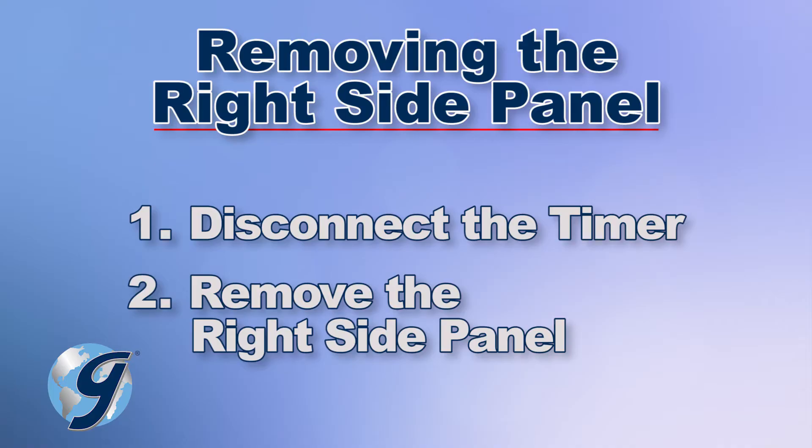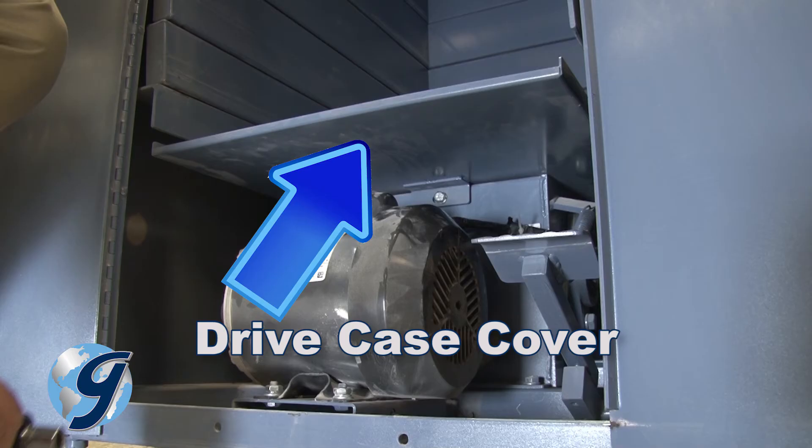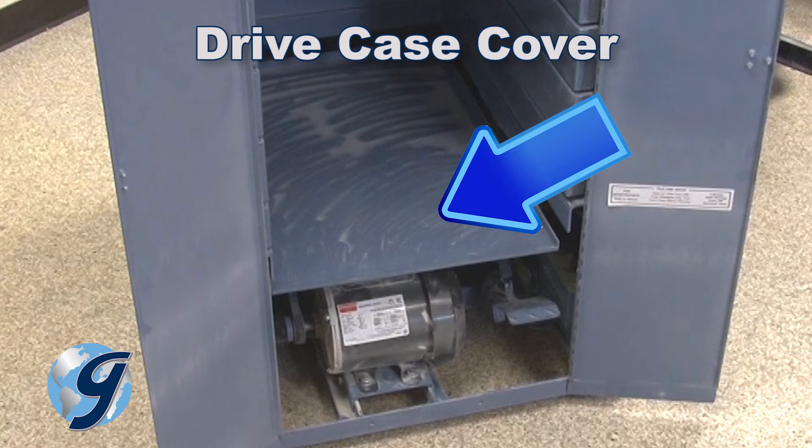To remove the right side panel, you first need to disconnect the timer connection, which is fastened to the front of the drive case. The connection is under the drive case cover. The drive case cover protects many of the mechanisms of the unit from excess exposure to materials being tested.